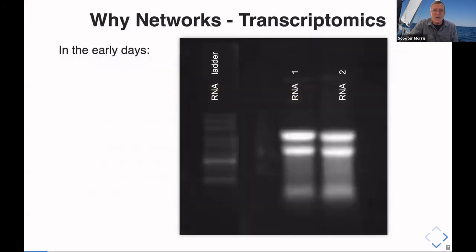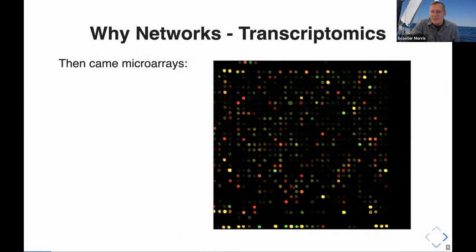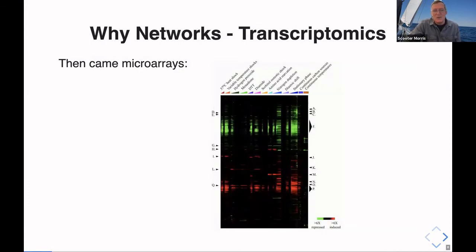So I'm going to take a brief tour through the history of transcriptomics visualizations. We started this way. This is what transcriptomics looked like. And then we got microarrays, and this is how we looked at microarray data. And then we got down to clustering our microarray data.